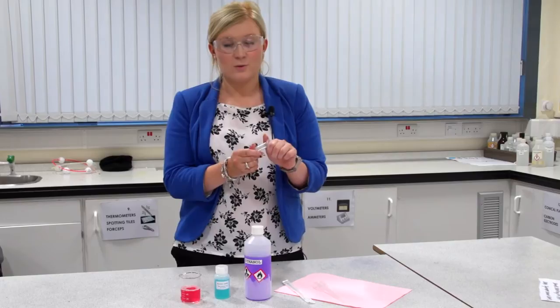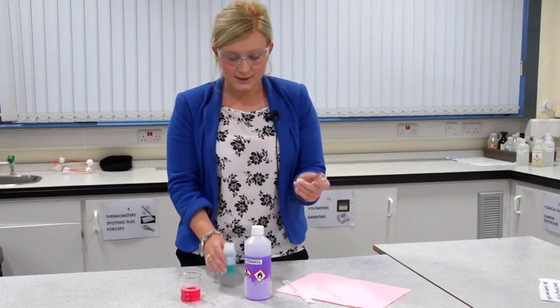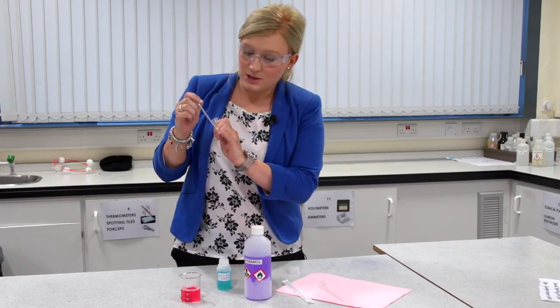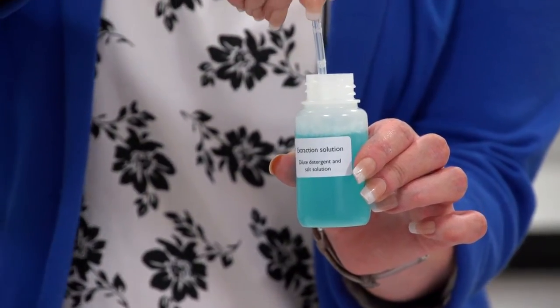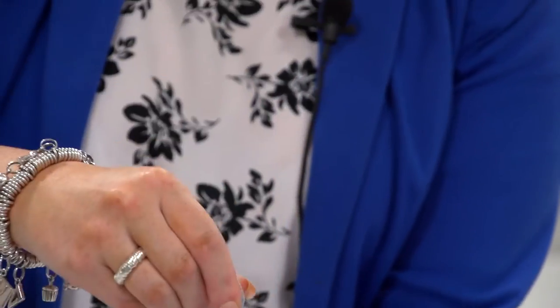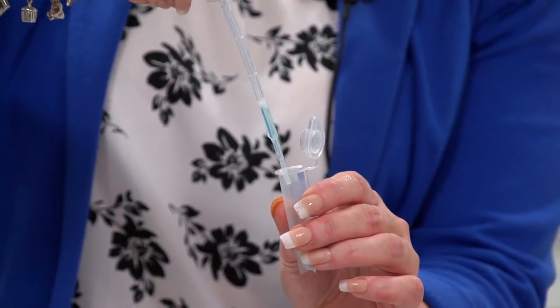Firstly, measure out one millilitre of extraction solution into your vial. Unscrew the lid and, using your dropper, extract the solution up to the one millilitre level. Squeeze the top of your dropper and insert it inside the solution. Release the dropper slowly until the liquid rises to the one millilitre level, then carefully drop the solution into your vial.